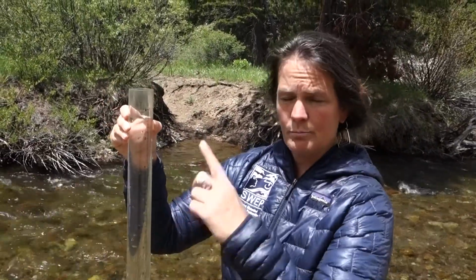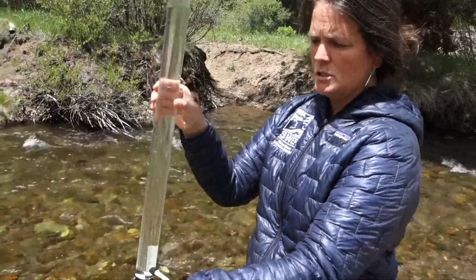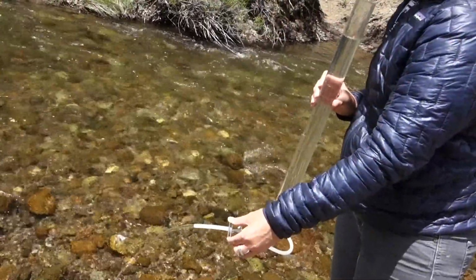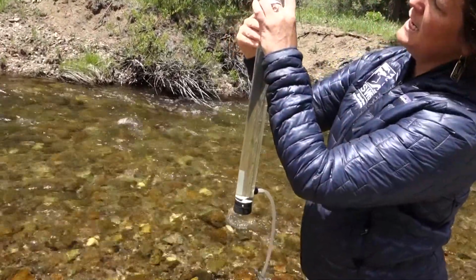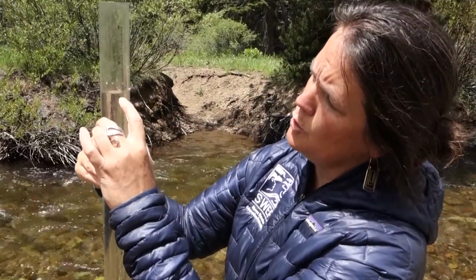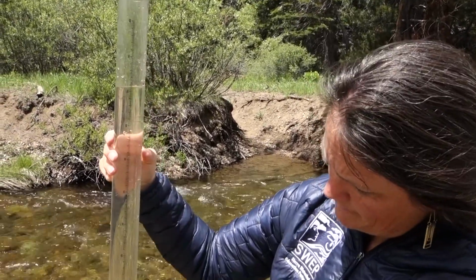If this water was murky and I couldn't see the Secchi disc, then what I would do is I use this little tube to release the water while watching. And then at the point where I can see the disc, I stop and I look on the scale, and let's say that's the point where I could see the Secchi disc, I would record 50.3 centimeters on my data sheet for the clarity.